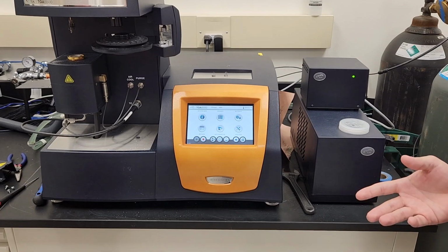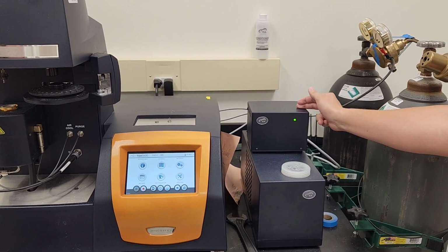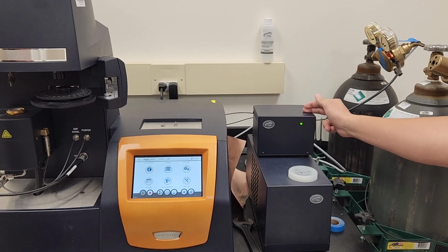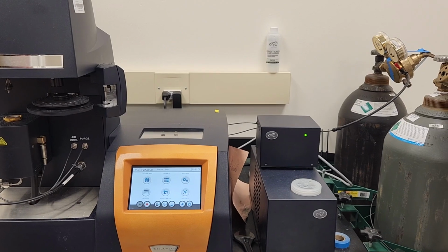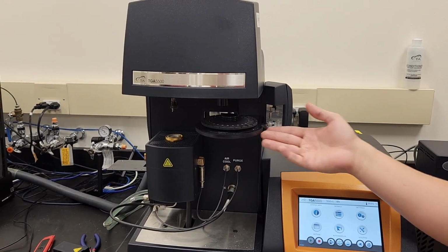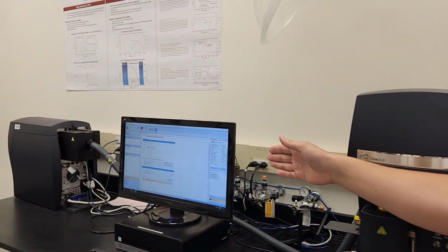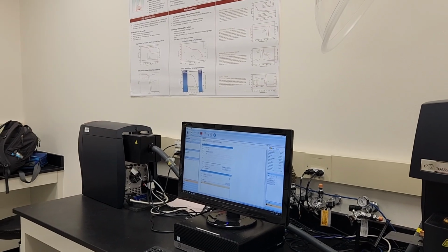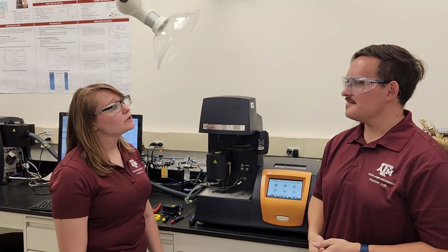Now, there are different add-ons that we have with this system, such as the gas blender, which helps us blend different gases such as CO2, nitrogen, and oxygen, and so that can help us use different experimental situations. We also have an auto-sampler here, which enables us to queue many different samples. And then lastly, our mass spectrometer, way over there, that helps us analyze the composition of different evolved gases. Wow, so TGA is pretty versatile then.